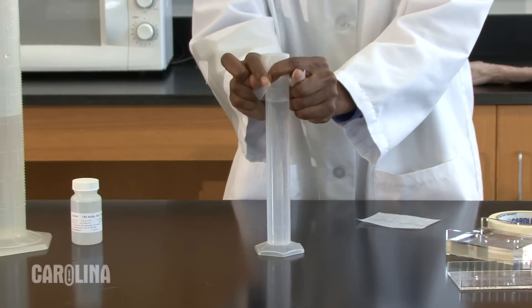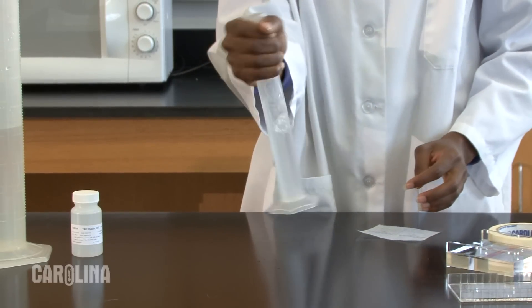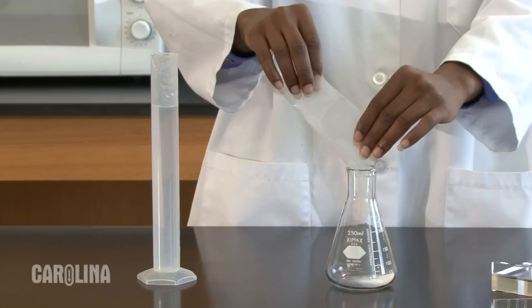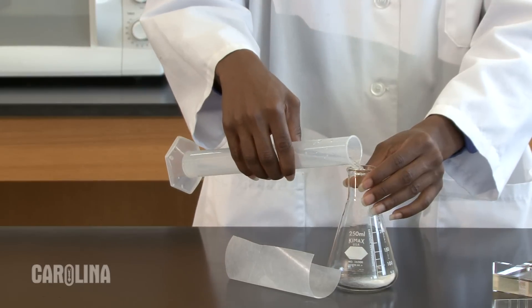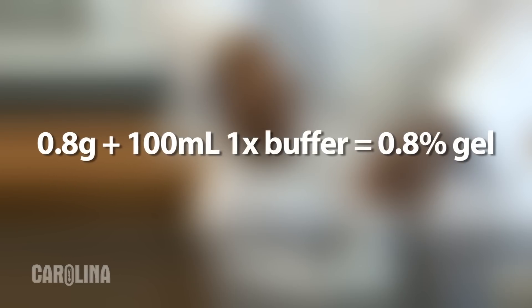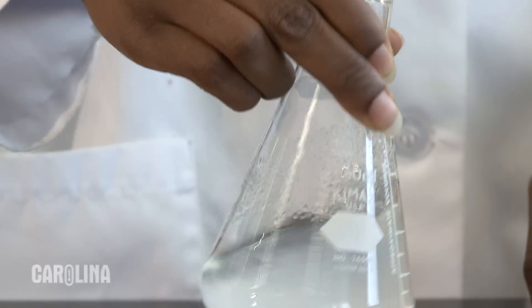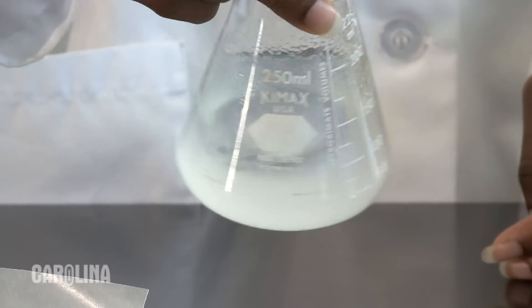I will mix this by sealing the top of the cylinder with some parafilm. I will make a 0.8% gel. To do this, I will mix 0.8 grams of agarose with 100 milliliters of the 1x buffer I just made. Swirl the flask a bit to distribute the powdered agarose throughout the buffer. Otherwise, as it melts, it will form a sticky mass which is hard to dissolve.